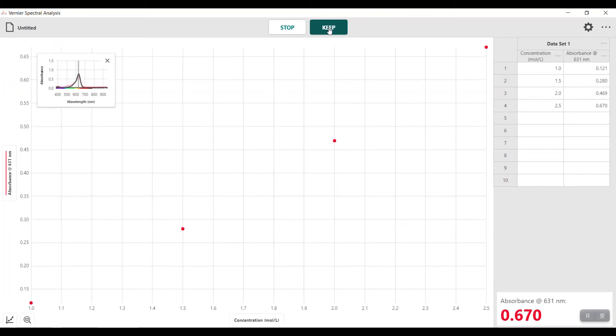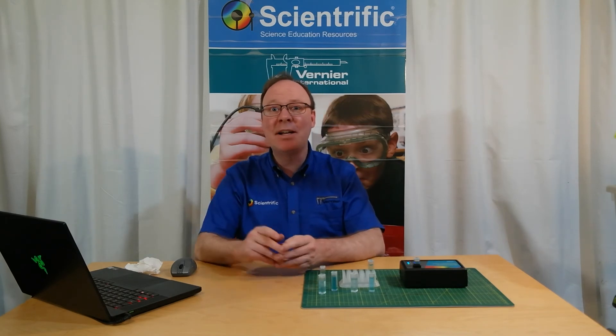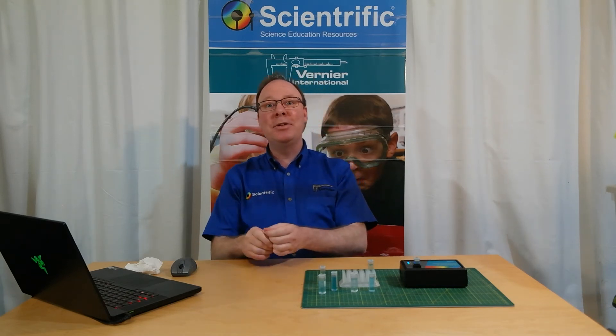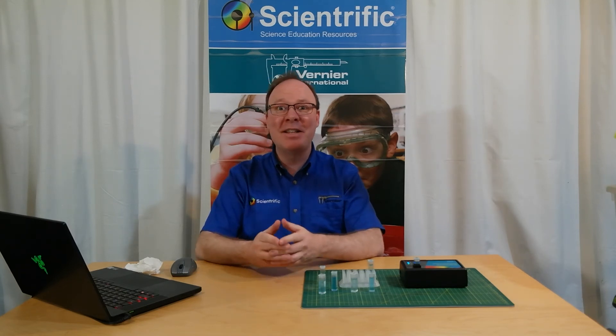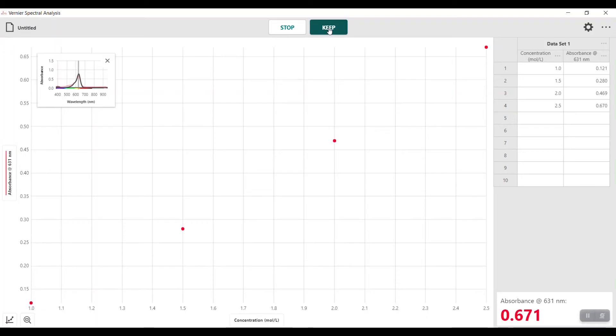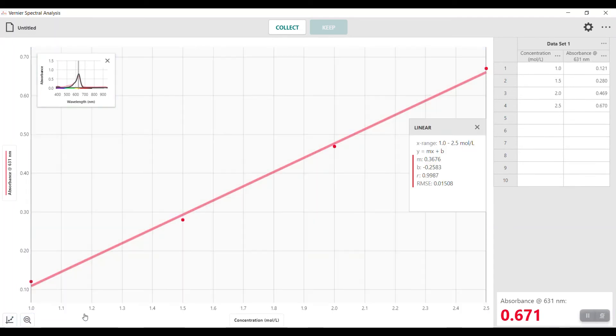This is the first step of the Beer's Law experiment. If I was going to be doing field trips and looking at nitrates in the water, I may want to set up this calibrated curve at school, so that in the field I only need to do one small sample and line it up. Now that I have all of this set up, I'm going to go Stop. I'm going to come down and make a linear curve fit — Apply Curve Fit, Linear. This will line up all my dots. I have an R-value of 0.9987, which for me is excellent.